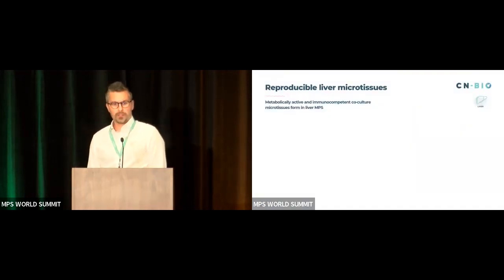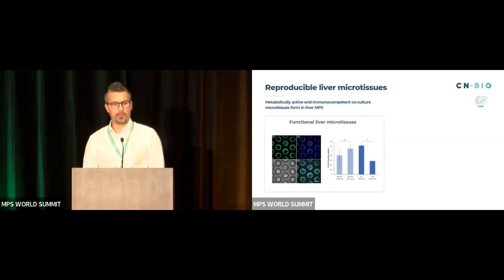So what we did was we got the system set up in the labs at the FDA, and we have the system obviously set up in our own labs, and we could then cross-validate between those two labs. First of all, we started pretty simply. Well, could they form the same consistent liver microtissues? And the answer is, well, yes, we could. See the standard sort of images there.